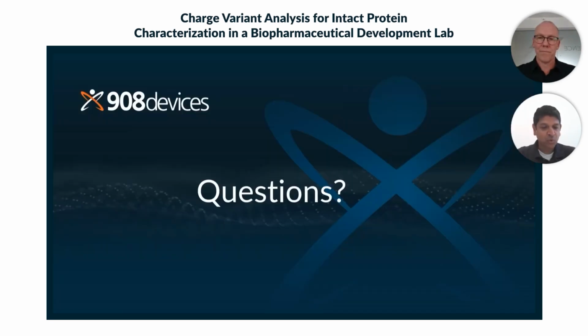We have time for just one more question. So here it is. Do you use zip chip for other applications than intact native MS analysis? Yeah, we've tried it also for peptide mapping, and if you want to do extremely fast peptide mapping, you can do it on the zip chip, but you will need a fast MS, because we're talking about a 10-minute separation window.